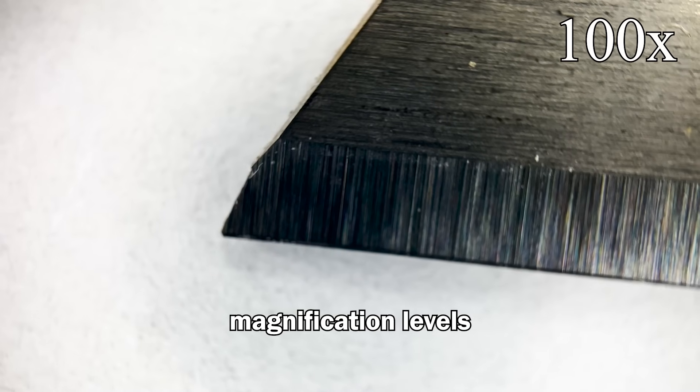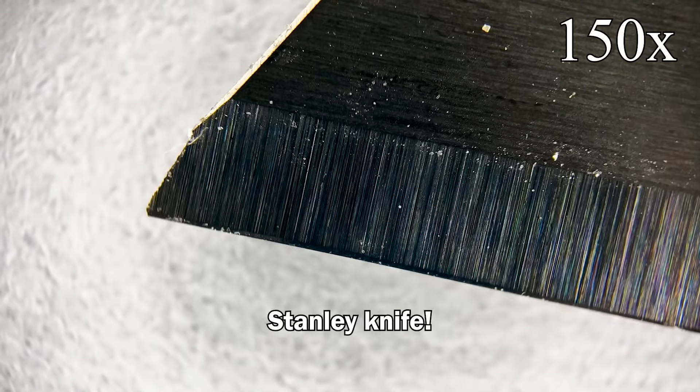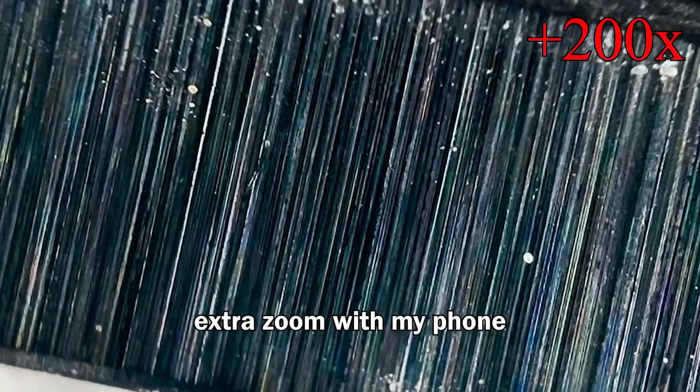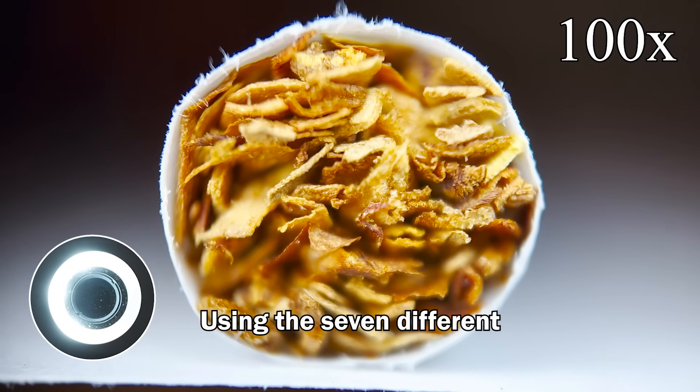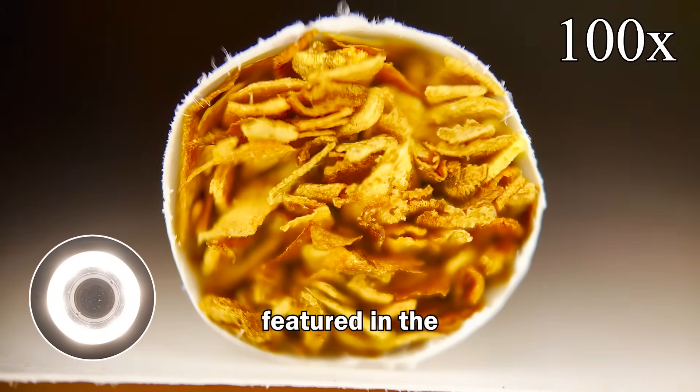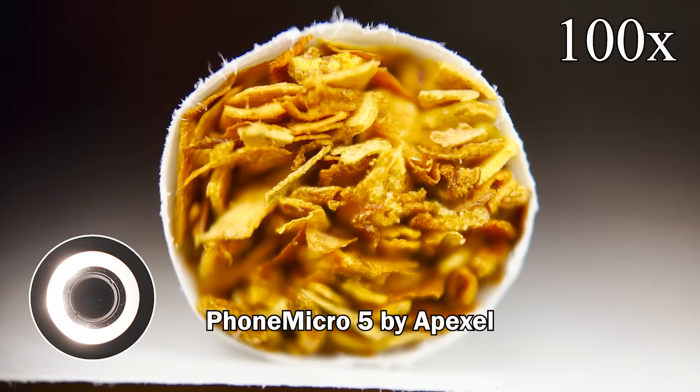I tested out the different magnification levels on this super sharp Stanley knife — I even added extra zoom with my phone. And here's what the end of a cigarette looks like using the seven different lighting modes featured in the Phone Micro 5 by Apexel.